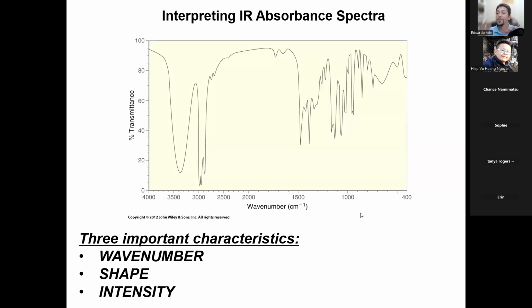Okay, so now that you've seen the actual motions of the molecules, hopefully these peaks mean something to you, right? So remember that alcohol that I showed you, the OH stretching very strongly? I'll tell you as a preview that this entire thing is an OH that is stretching. And look at the wave number. This wave number is 3400 roughly, right? High wave number, so high energy, and you saw in the animation that the arrow was very, very long. It was a very intense stretch, and that's why you see it go all the way to the bottom. It's at like 10% transmittance.